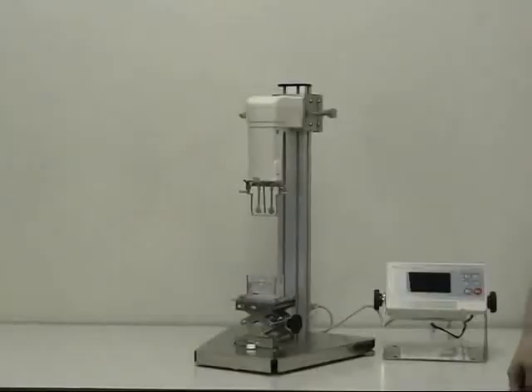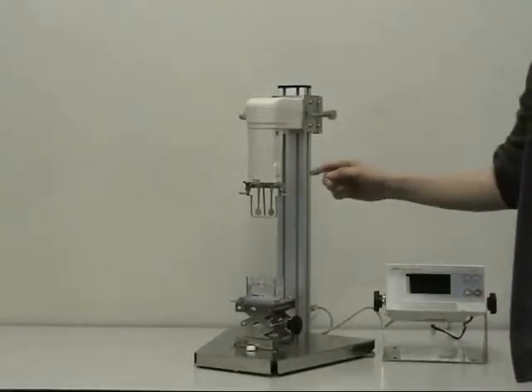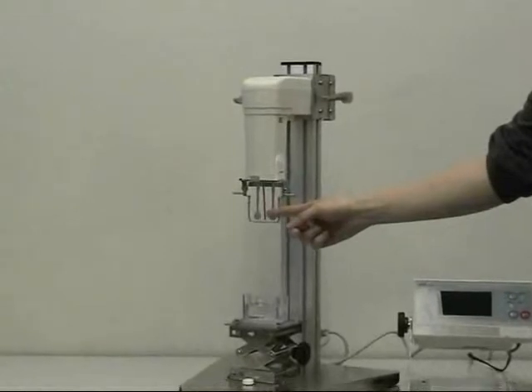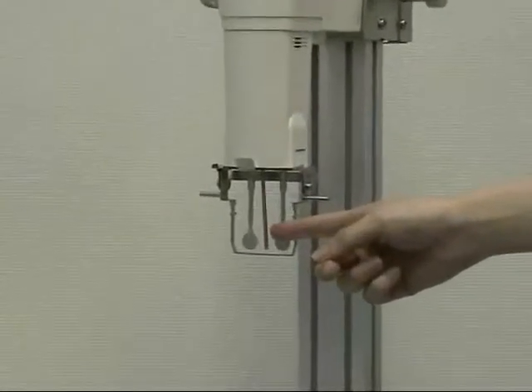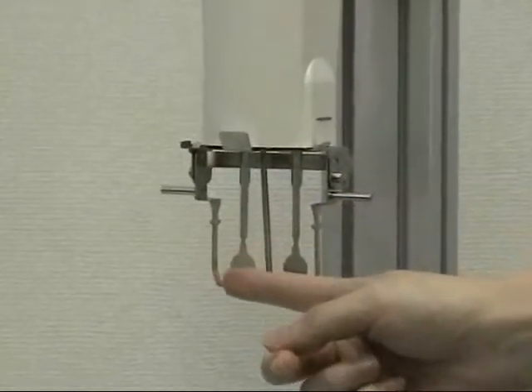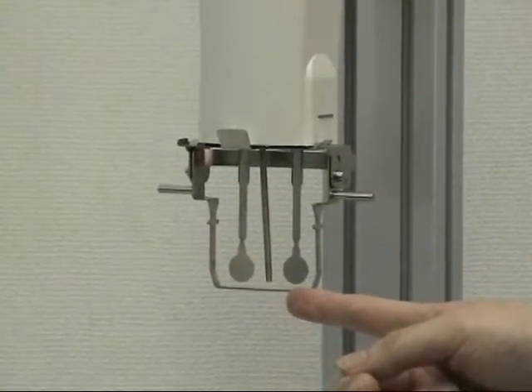The sensor unit has a temperature sensor that can measure temperatures between 0 and 100 degrees Celsius, or 32 and 212 degrees Fahrenheit. The sensor plates are located on either side of the temperature sensor.